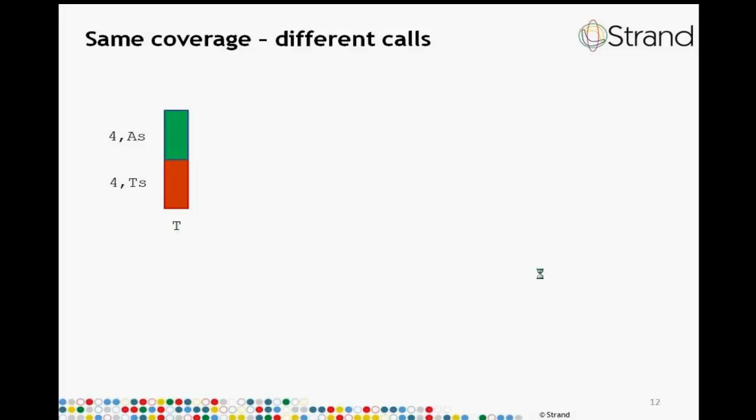We will not go into the actual statistical methods of the SNP caller. It is loosely based on MAQ and GATK toolsets, but we'll just provide some insights. For instance, let us say that the reference base is a T and there are 8 reads overlapping this location. 4 of the reads have a T at that location and 4 of the reads have an A at that location. Then what are the different genotypes that we would expect?